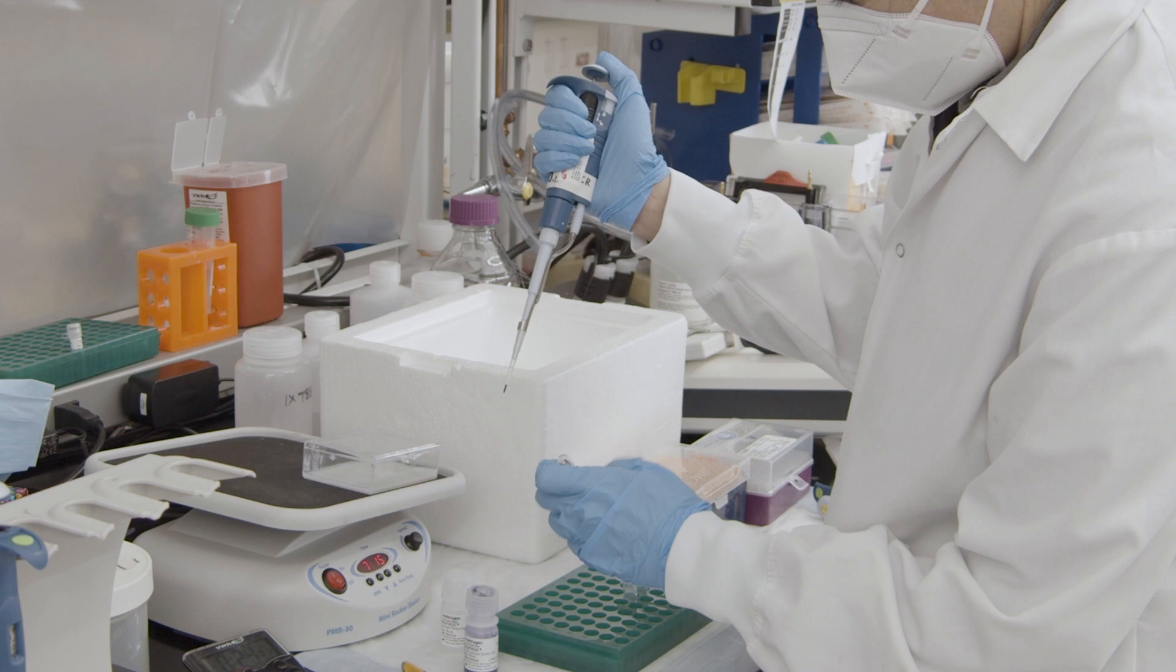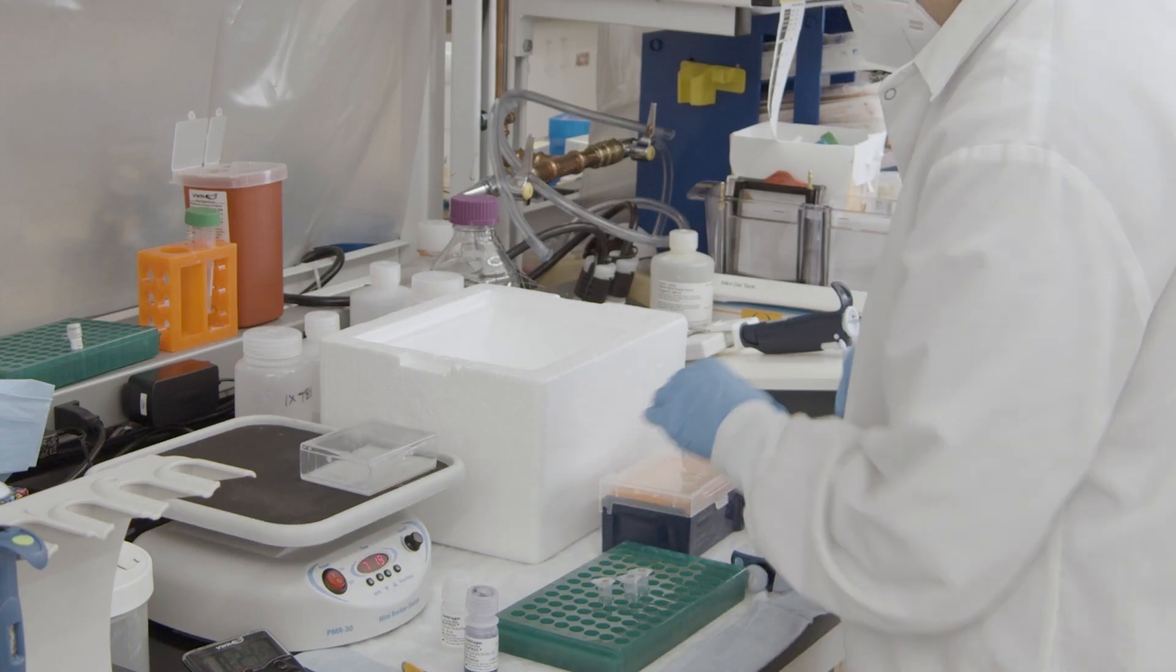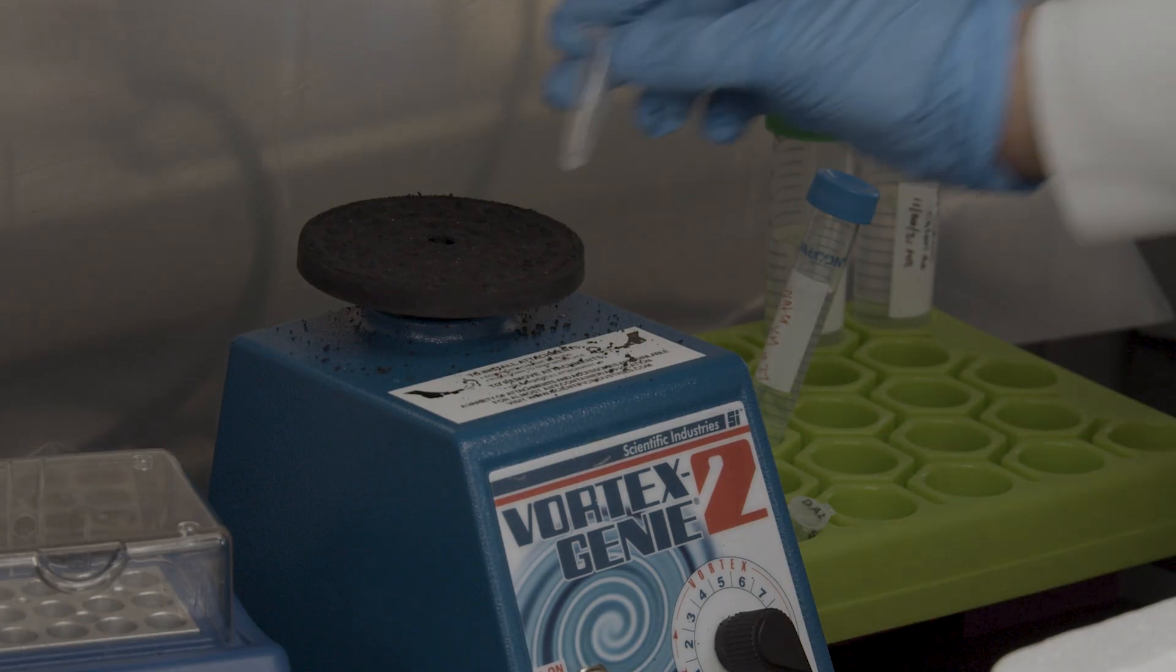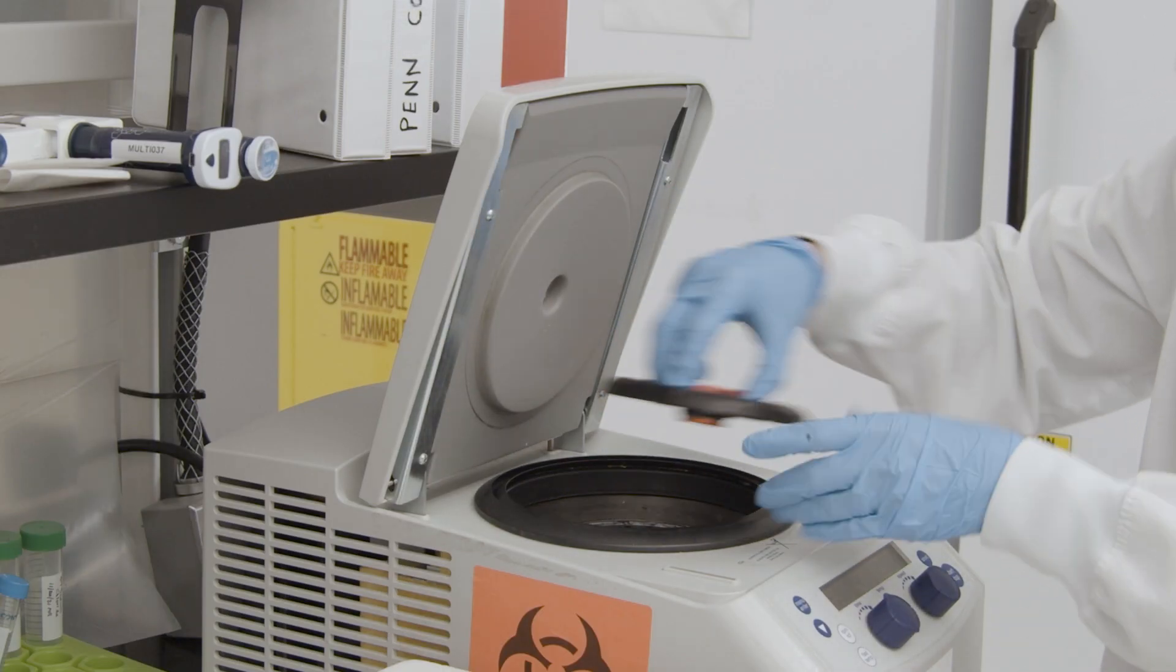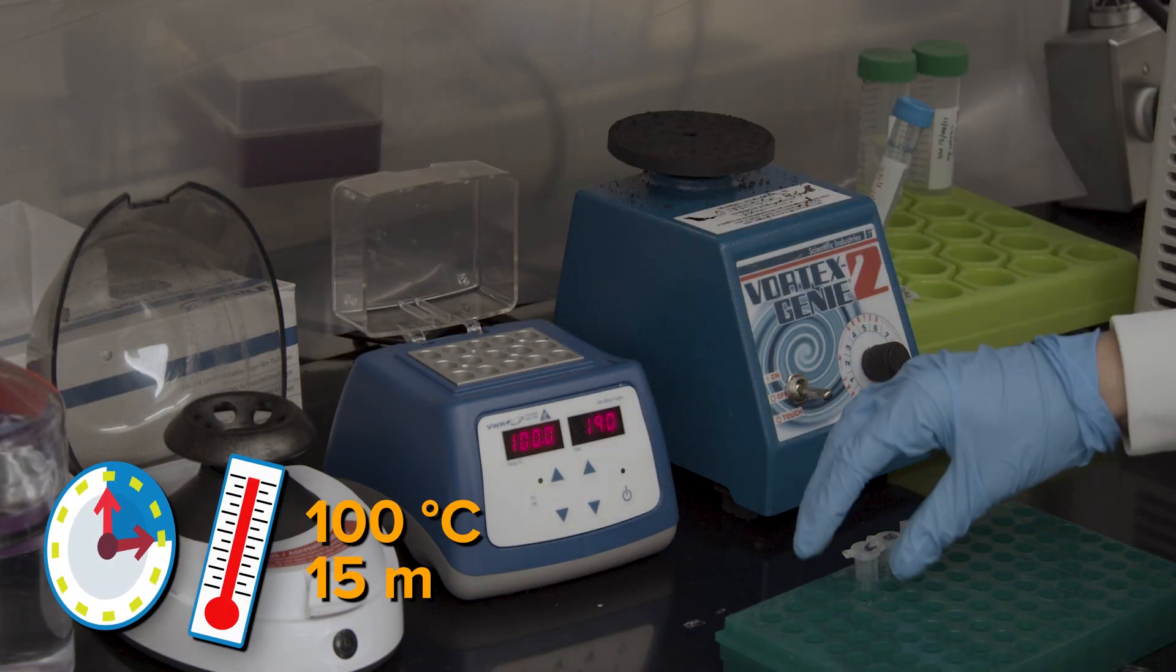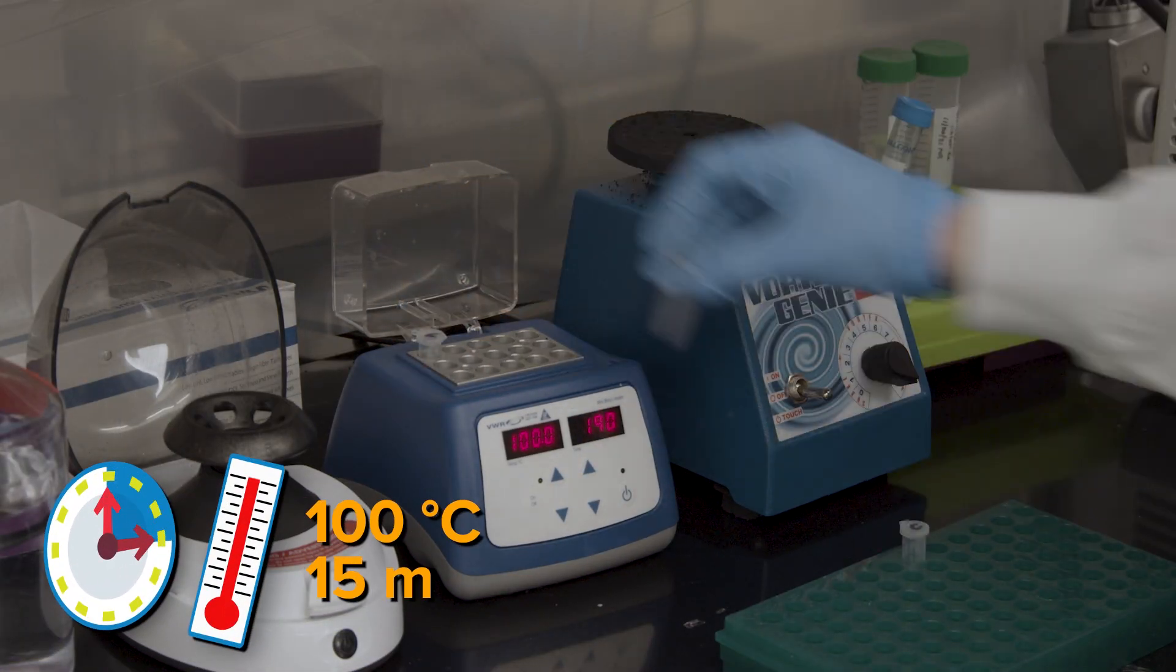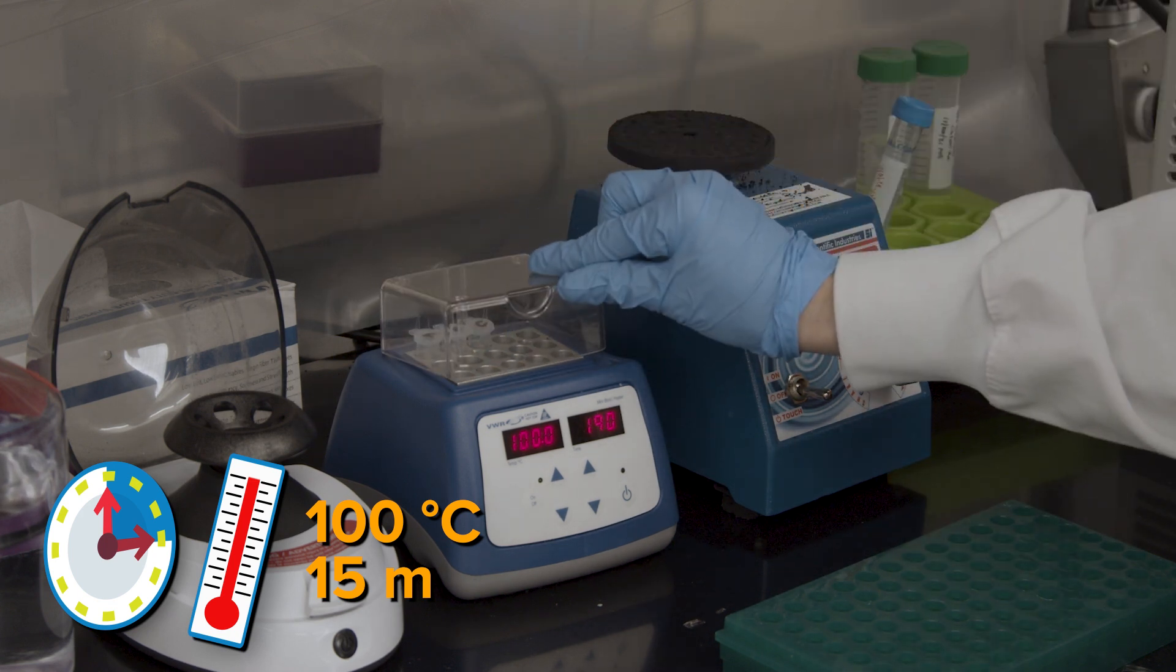In a microcentrifuge tube, combine the required volume of sample with set amounts of loading dye and reducing agent. Some people add distilled water to bring all the samples up to the same volume. Mix the samples by vortexing and centrifuge briefly. Boil the samples at 100 degrees Celsius for 15 minutes. This will reduce and denature the proteins in the sample. 15 minutes? Why that's just enough time to prep our SDS page gel for loading!